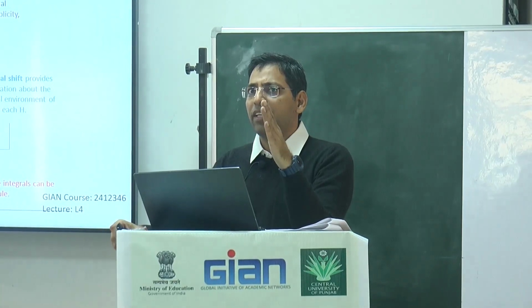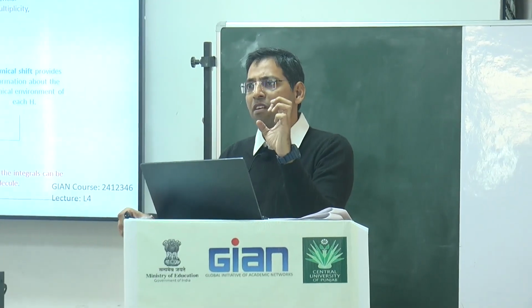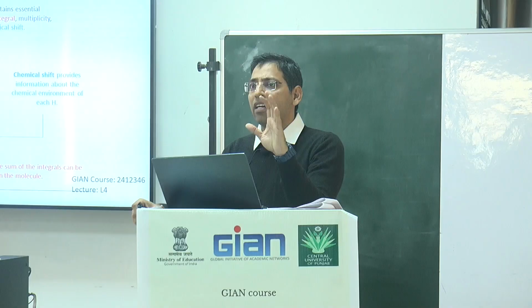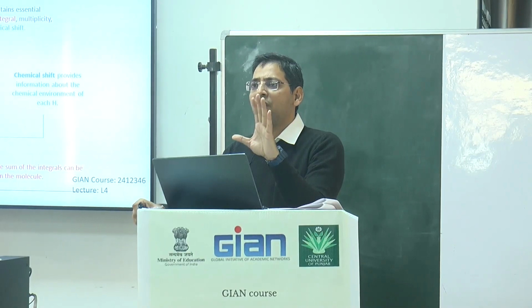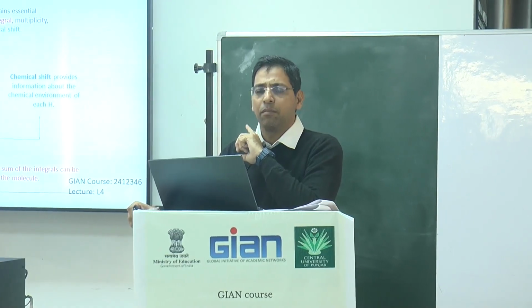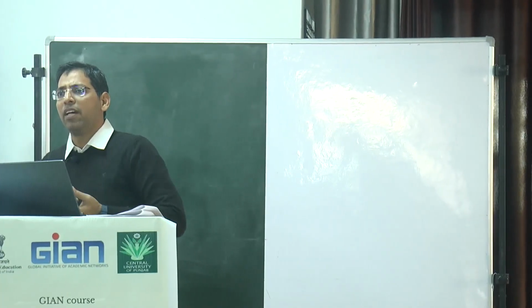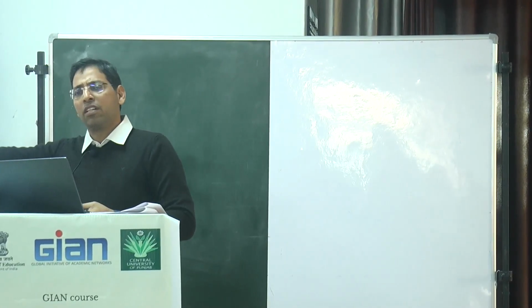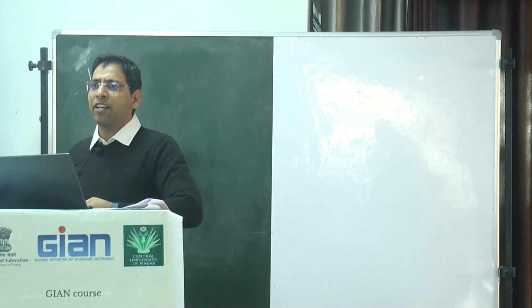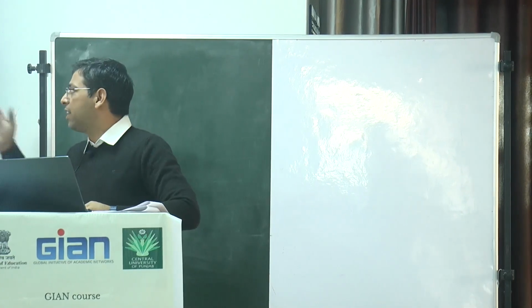If you know the peaks coming at what ppm, you can analyze what type of functional group is present, and how those functional groups are pushing the signals far away from the zero value. So here this zero value is the TMS, but now if a more complex compound is giving the ppm in this direction. So in the last presentation you know very well, these are the amino, then there is a sugar, and then more complex compounds come later on.